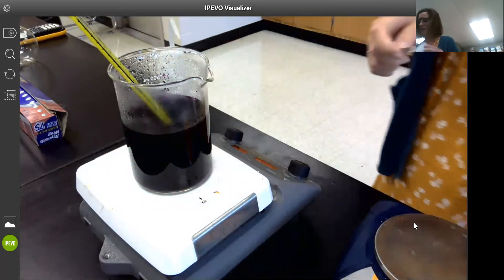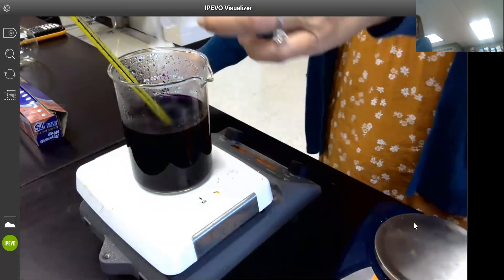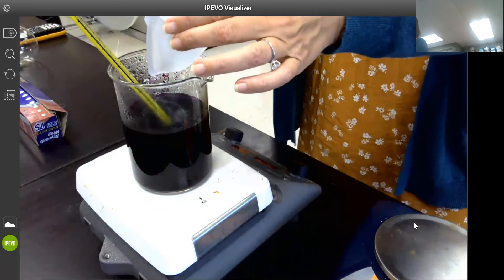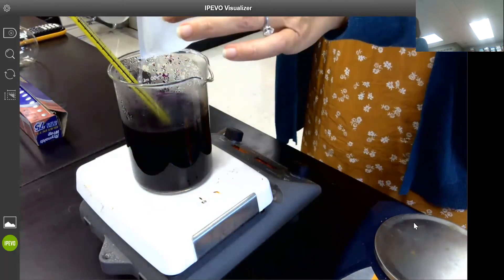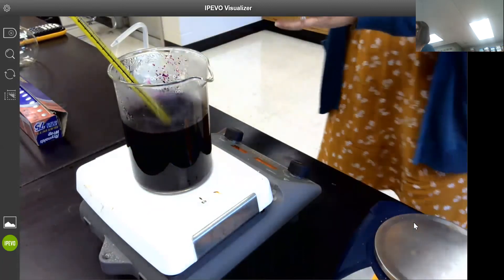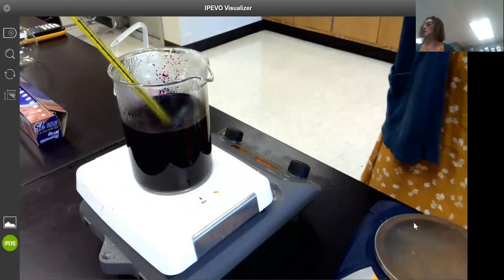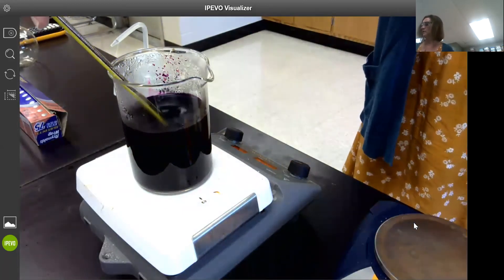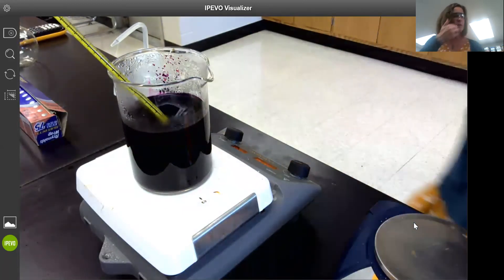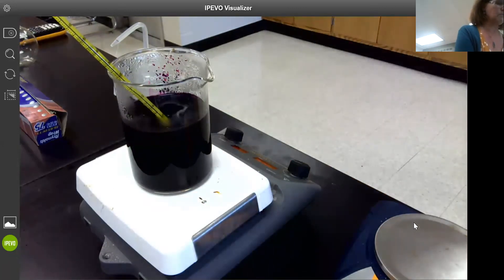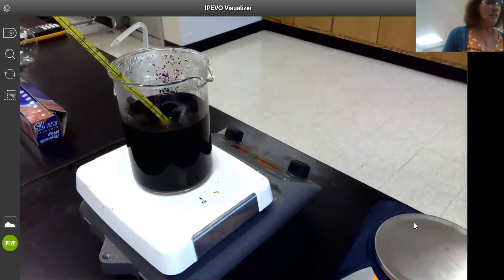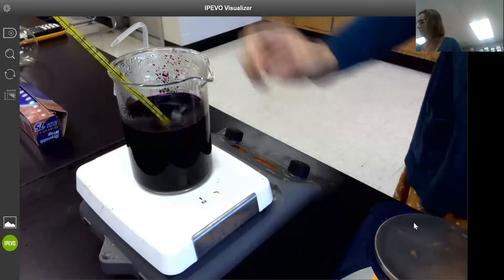I'm going to rinse off that little boat so I make sure I get all of it in there, and I'm going to let this stir and heat until we reach, according to our instructions in part one, until it reaches 90 degrees Celsius. This is for the complete dissolving of that solid.